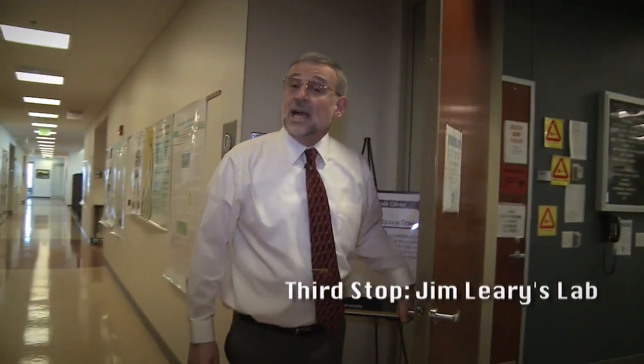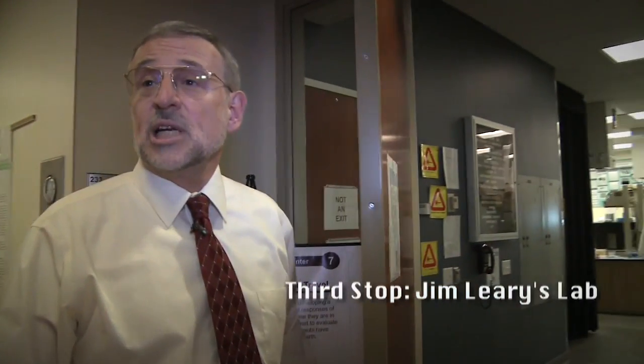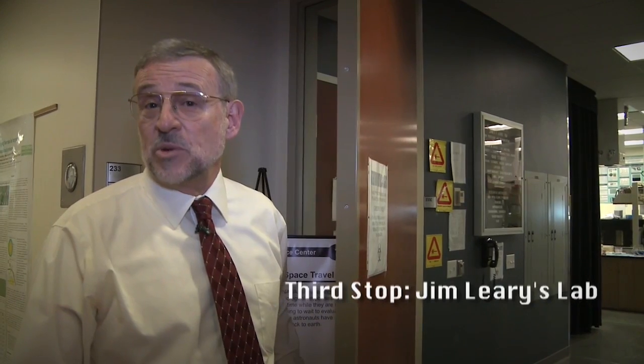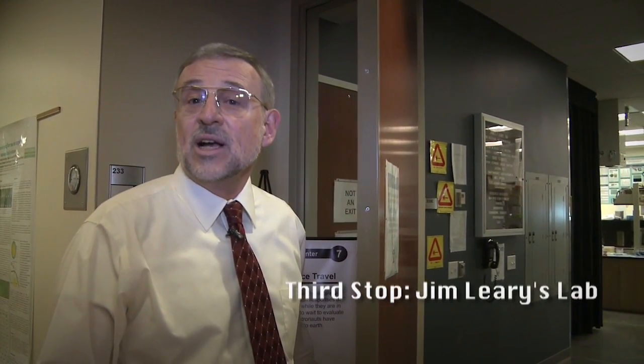Now let's go inside my lab and I'll show you some really cool technology where we're using laser beams to look at cells streaming past at more than 50,000 cells per second. And we're going to be using this to look at very, very rare cancer cells that are inside blood.